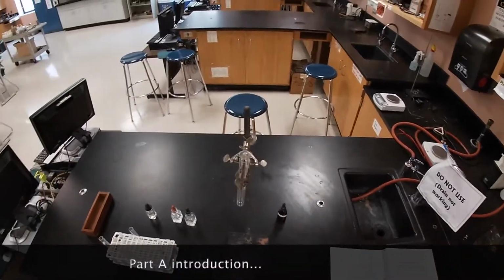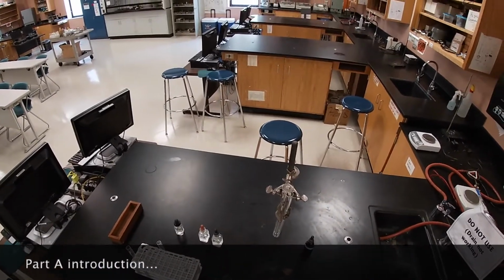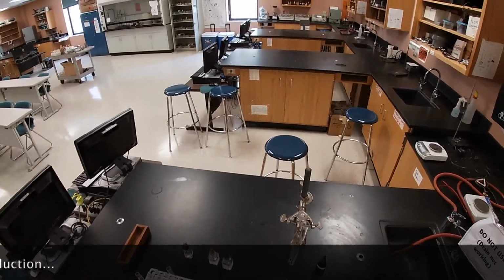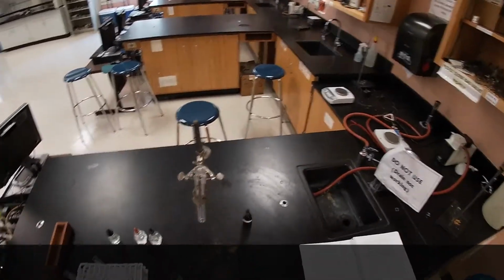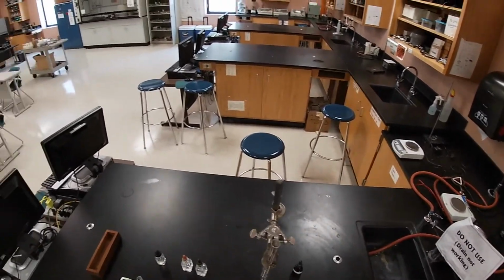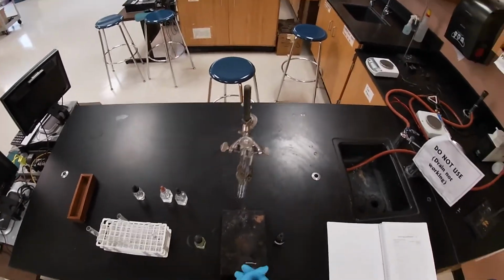And so what we're going to do is get a bunch of soluble solutions and mix two of them at a time. When we mix those two, we're going to determine whether that actually forms a precipitate. A precipitate is nothing much more than an insoluble substance. So we'll have two solutions, and I'll go over it during the explanation.